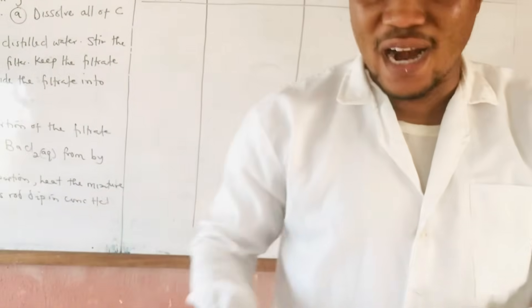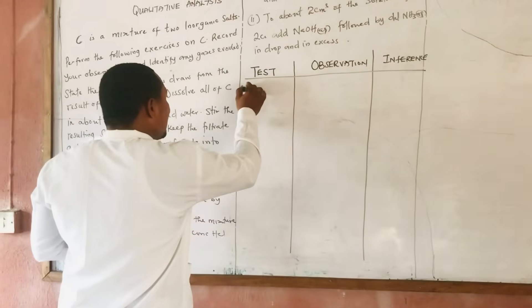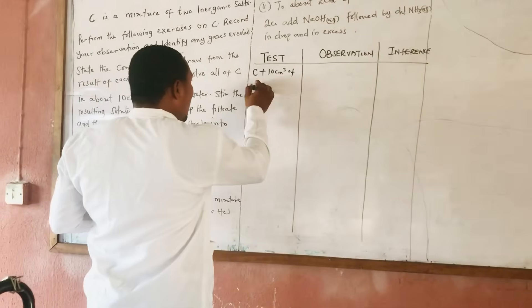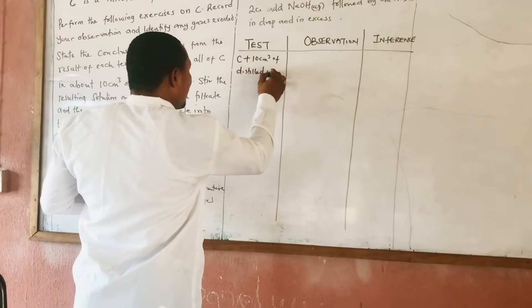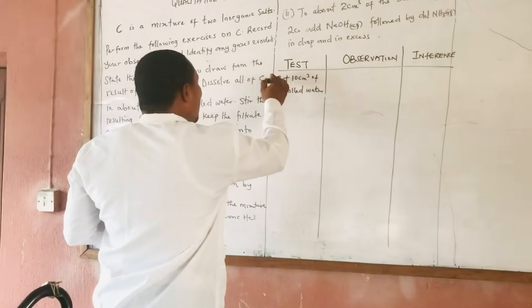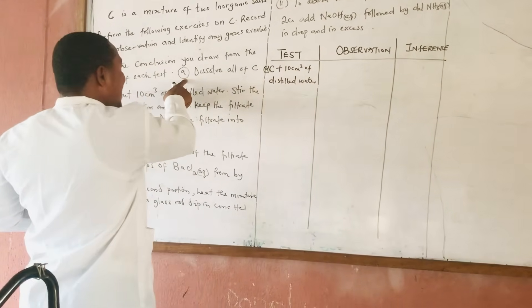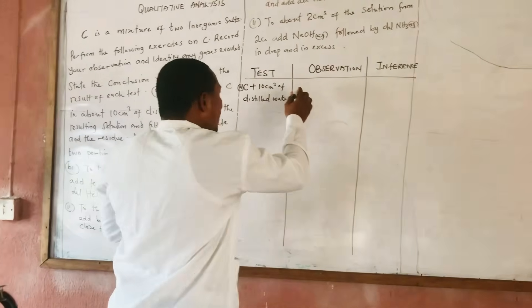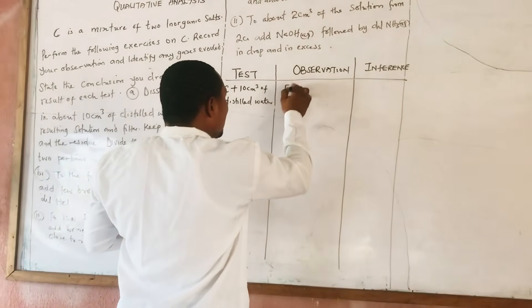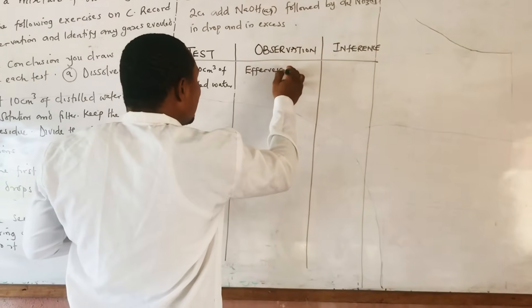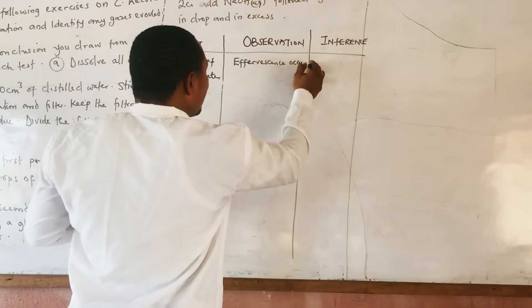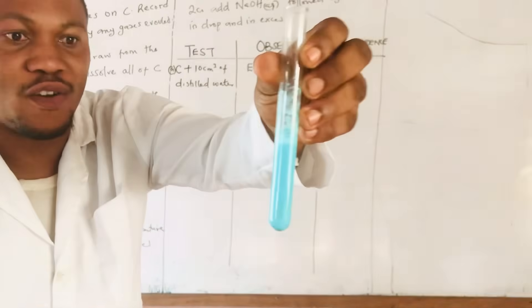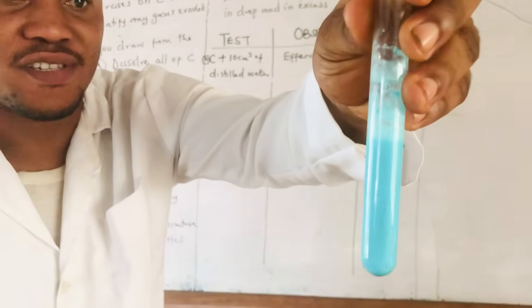So I can record that: C plus about 10 cm³ of distilled water. What is my observation? My observation number one: effervescence occurred. That is very obvious. Then they say: stir the resulting solution and filter.